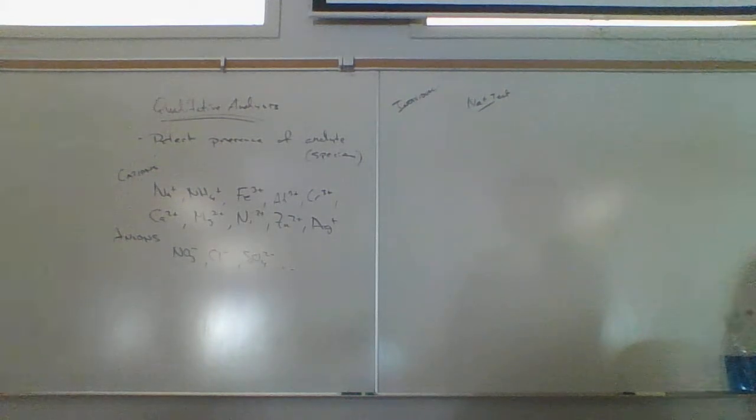And burning off the sodium can take a long time. Last semester somebody was standing here and after about 30 minutes they gave up. What they did was they went and got a clamp, like a 3-prong clamp, clamped their wire and then just left it over the burner. And they came back another hour later and it was finally clean, but it took an hour and a half of burning to get that wire clean. Well, hopefully this doesn't take that long.